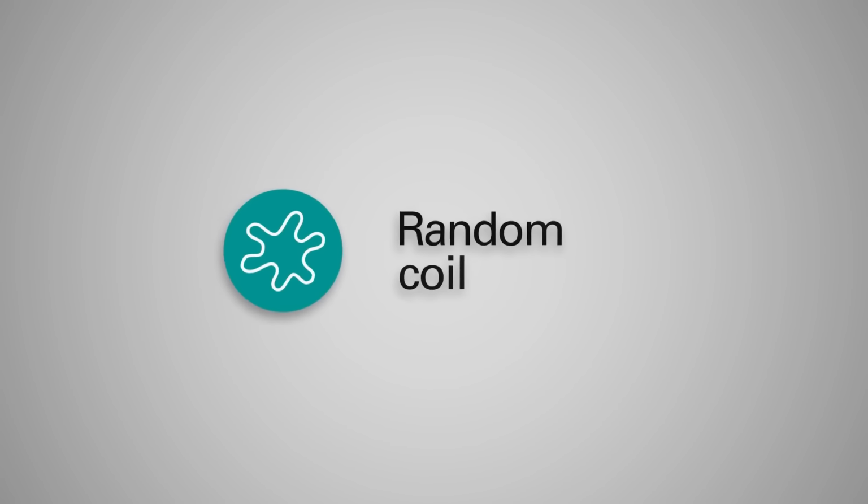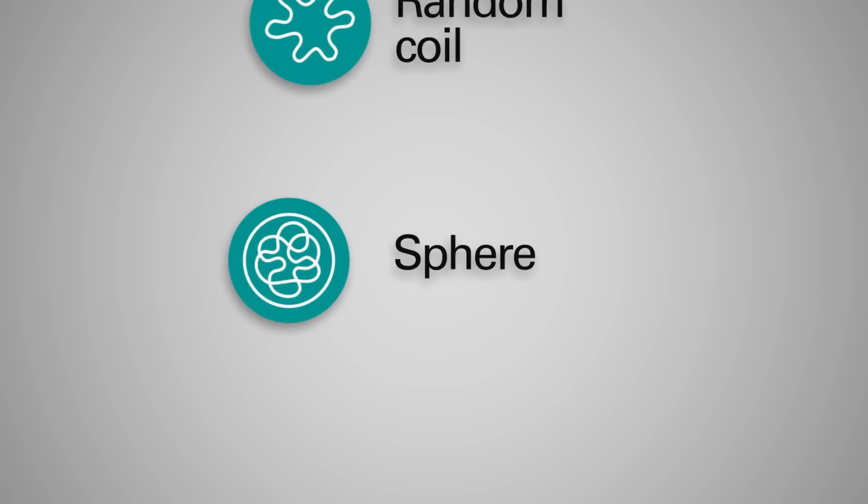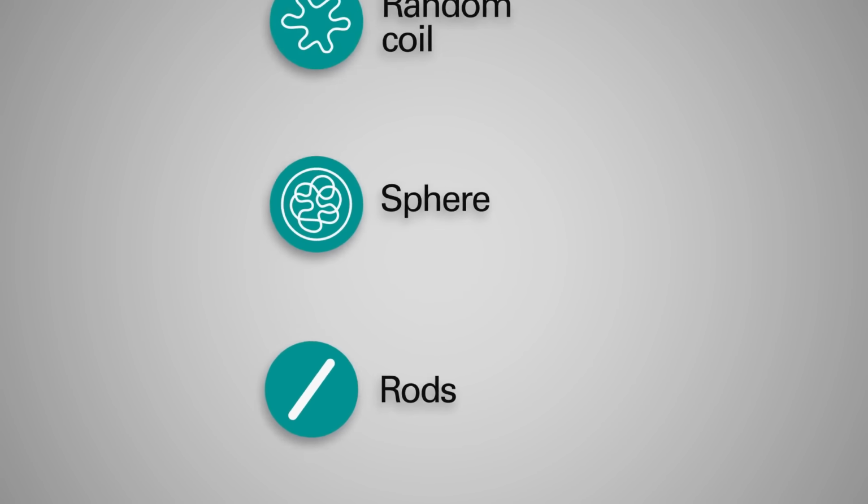But for this part, we developed a new method. We know from the literature that for each shape, for example random coil, sphere, and rod, at each molecular weight, we know how the scattering differs between these angles. Then we can incorporate the data in the software. After you have your results, we can compare the scattering profile with different shapes at the molecular weight we measure.